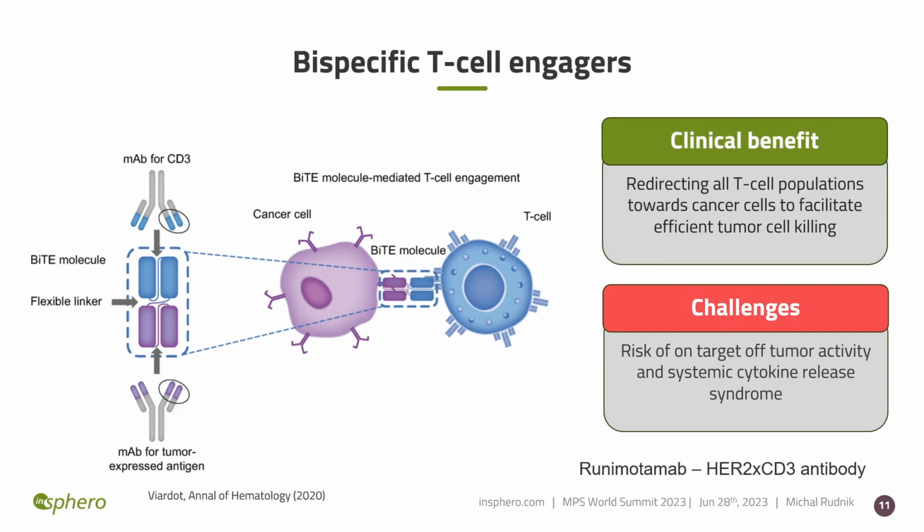As a model molecule, we have evaluated the efficacy and safety of runimotamab, a HER2 bispecific antibody, which is currently in phase 1 clinical trial. Bispecific T-cell engagers are engineered antibodies combining a domain recognizing the CD3 antigen on T-cells and a cancer-associated antigen, in our case HER2, which is a receptor commonly expressed on tumor cells. The coupling of those two domains allows the molecule to engage T-cells with cancer cells and facilitate lysis and a polyclonal T-cell response by bypassing MHC signaling.